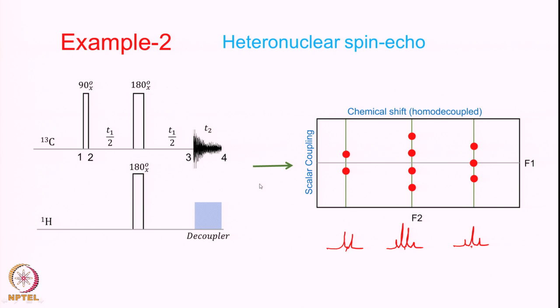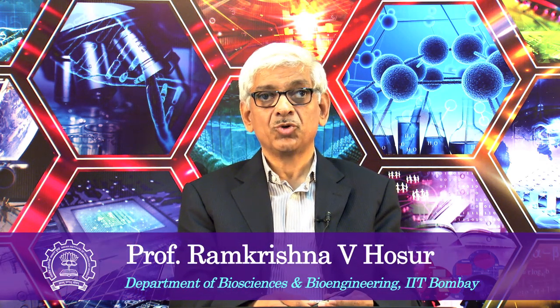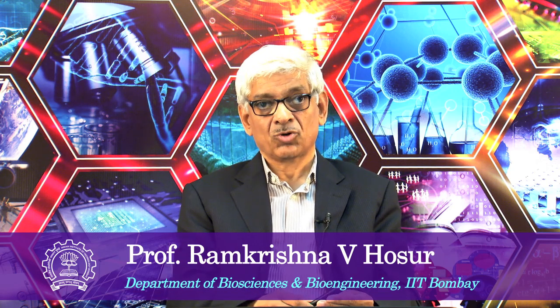So in all of these experiments we had considered carbon-proton coupling, right, and we are talking about experiments at natural abundance of carbon-13. Therefore, there was no question of carbon-carbon couplings evolving there. But if we were to do these experiments for protons, then of course it can lead to more difficulties, because there are proton-proton couplings which will be present in your experiment, and then you will have to deal with what is called the homonuclear 2D J spectrum, and this will result in more complications.